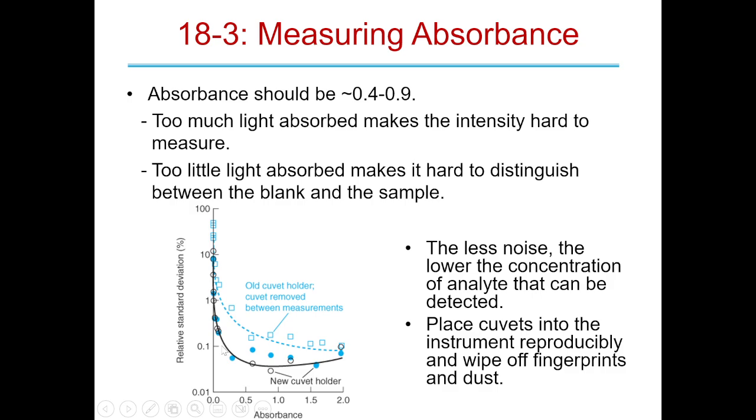Once you get down past 0.1, usually this data is just worthless, okay? Absolutely worthless. Again, that would be somewhere around here, right? See, that's where it starts really going exponential. This is why 0.4 to 0.9 is typically used. See how it's the lowest area?